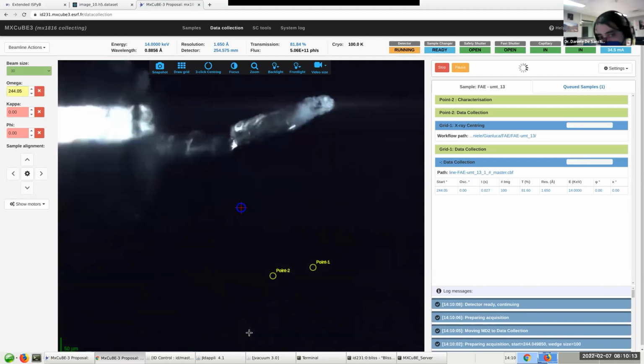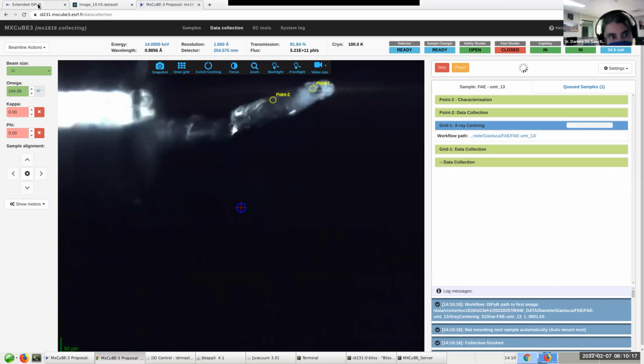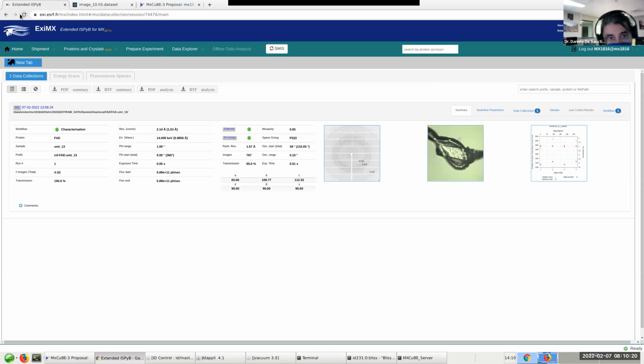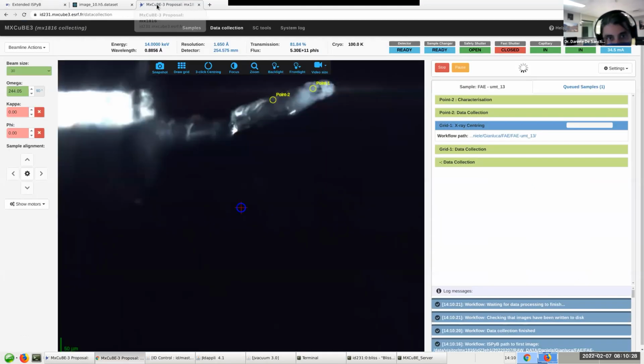Here it comes. So all the results of all this, you can also inspect them in ISPyB. Again, I'm going to leave it to Gianluca to show you that afterwards with the necessary plot.